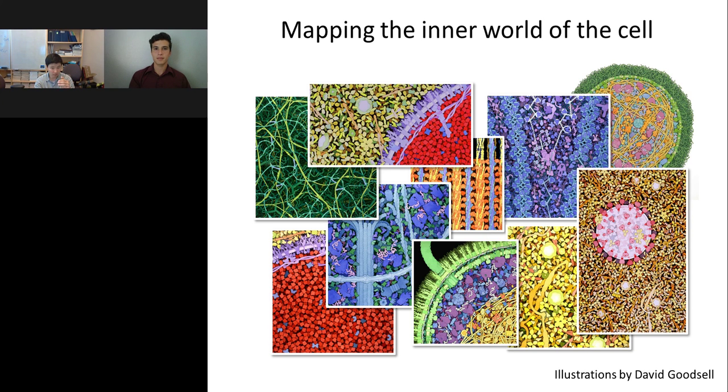But for sfCherry1-10, we did see a little more cytotoxicity compared to GFP1-10, as the cell may grow slower when there's too high an expression of sfCherry1-10. These are our experiences with cell lines.